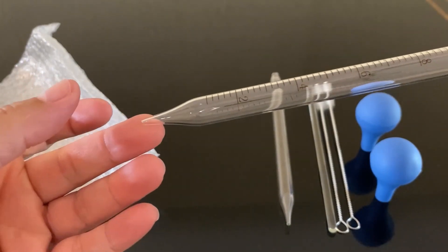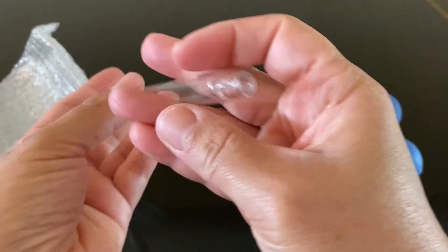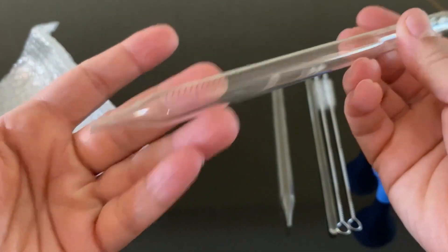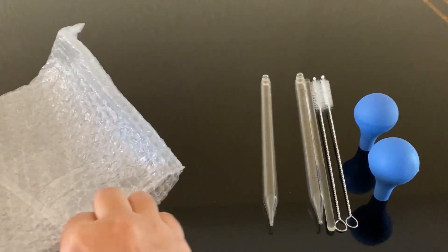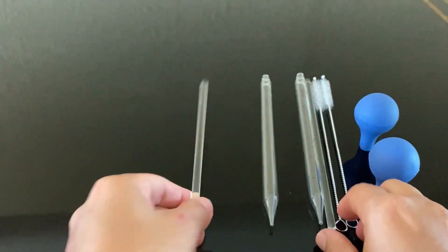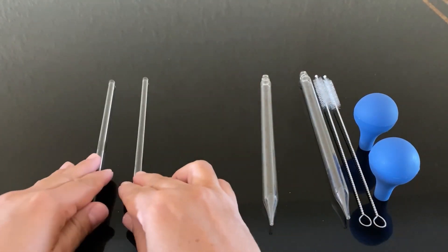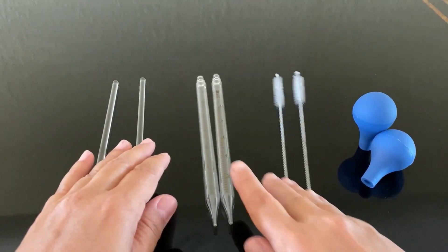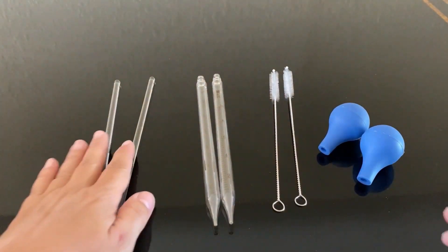So they are made from high-quality borosilicate glass, which ensures durability and chemical resistance. Each dropper holds up to 10 mils of liquid, perfect for most essential oil applications. They have graduated markings that measure and dispense liquid precisely with clear markings on the glass.